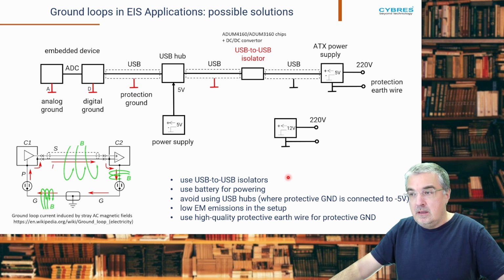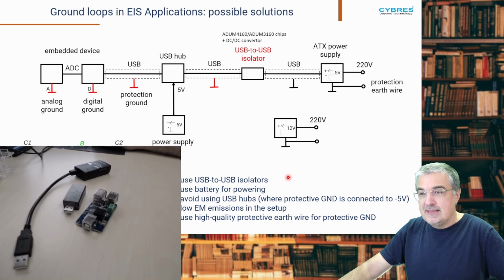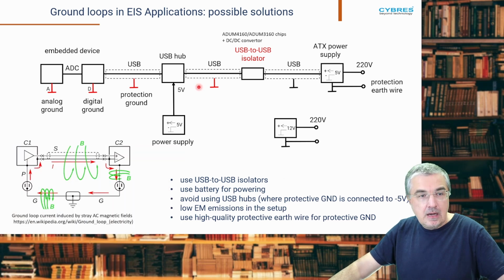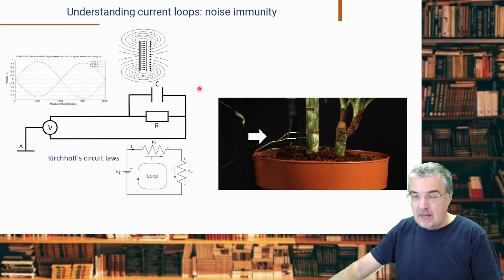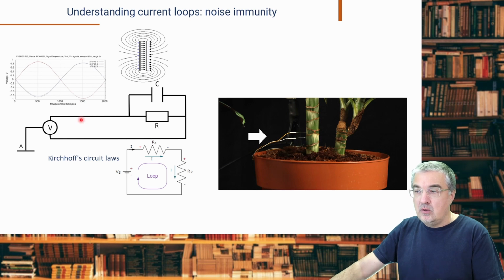But in impedance spectroscopy, we have a second point that is related to the current loop in measurements. Again, in impedance, when measuring resistance or impedance, we generate a difference in potential. In our case, it is an alternating signal. We can use a sinusoidal or chaotic signal, depending on what we are going to measure.